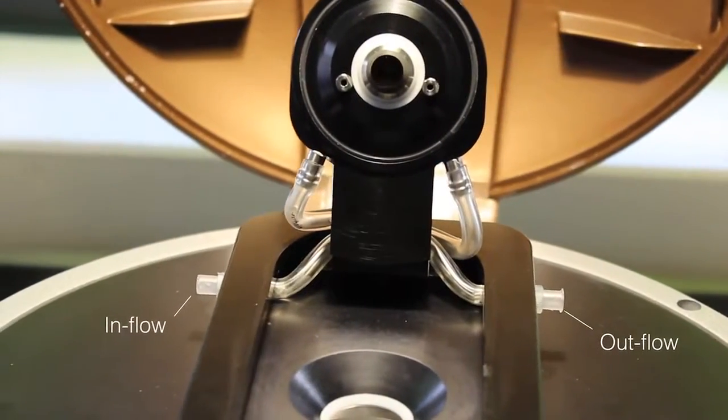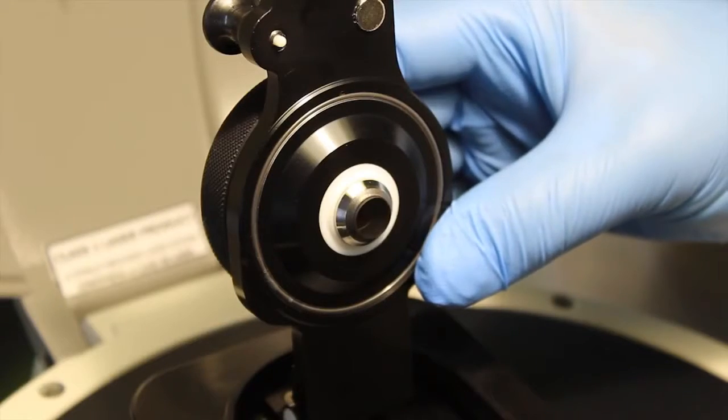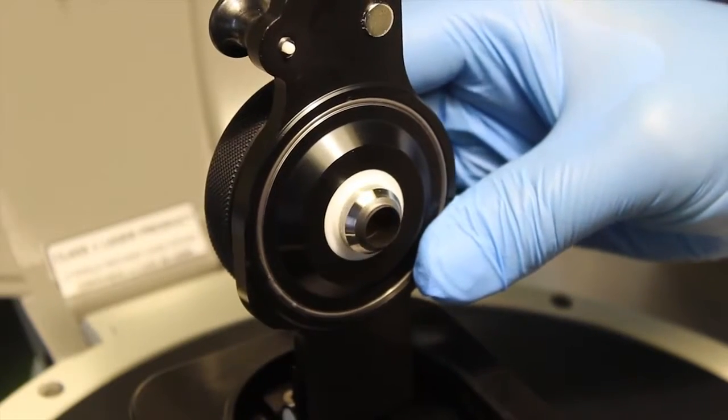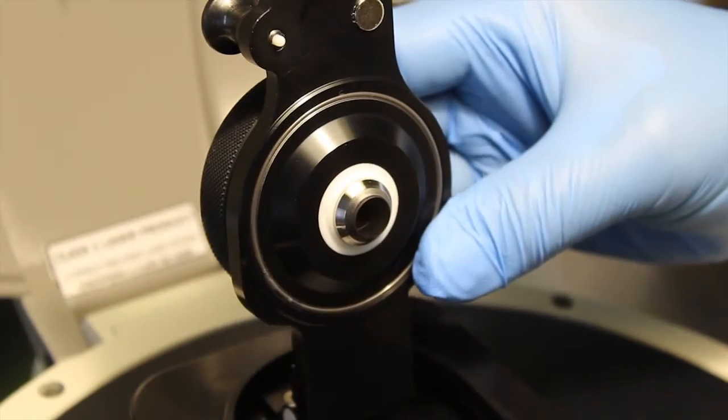No need for calibration. A unique flusher system to prevent aggregates and bubble formation by a simple press button action.